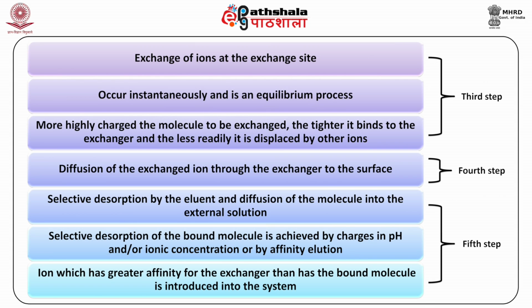Thirdly, exchange of ions at the exchange site. This is thought to occur instantaneously and is an equilibrium process. The more highly charged the molecule to be exchanged, the tighter it binds to the exchanger and the less readily it is displaced by other ions.